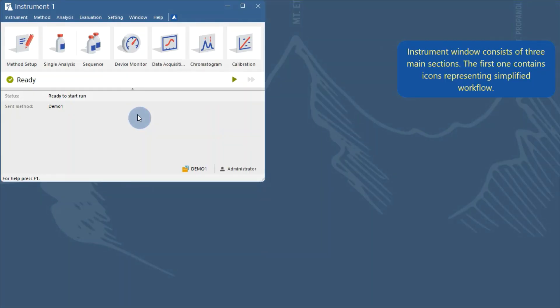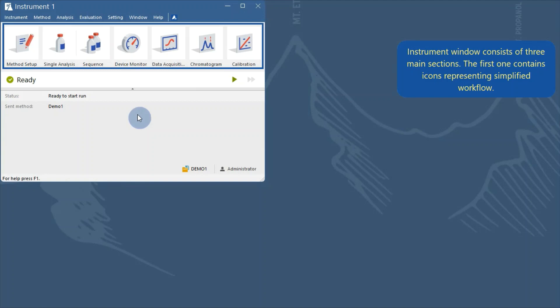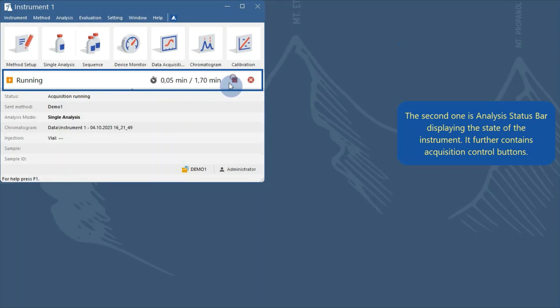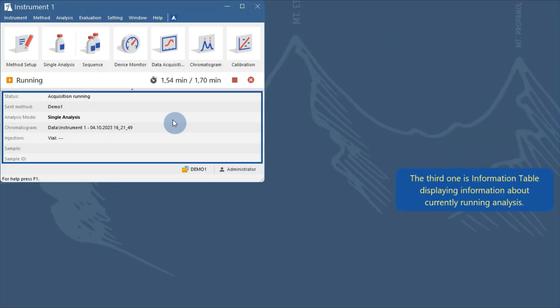The instrument window consists of three main sections. The first one contains icons representing a simplified workflow. The second one is an analysis status bar displaying the state of the instrument, and it further contains acquisition control buttons. The third one is an information table displaying information about the currently running analysis.